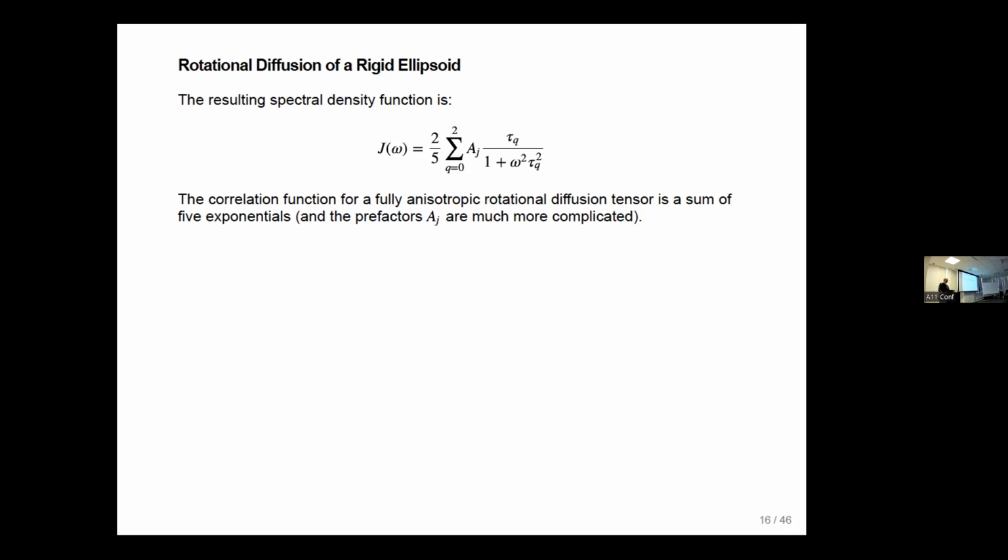So at around 900, they're roughly equal to each other, which is why the TROSY effect is effective at 900. And you scale quadratically with the field, right?